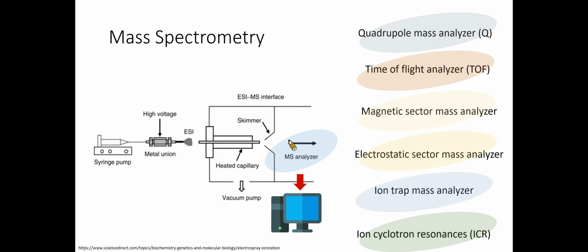Mass spectrometry is an analytic method that employs ionization and mass analysis of compounds to determine the mass, formula, and structure of the compound being analyzed. A mass analyzer is a component of the mass spectrometer that takes ionized mass and separates them based on mass-to-charge ratios and outputs them to the detector, where they are detected and later converted to a digital output.